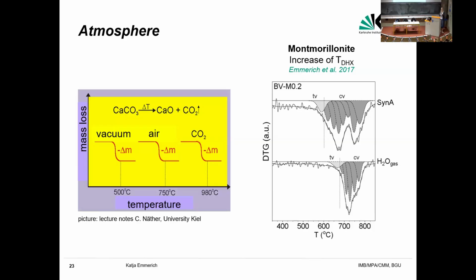Then you might apply this, or you might use these large crucibles, but then you have to think about an atmosphere that can form within the sample. Because if a gas is evolved, it has to diffuse out of the sample, and as long as it stays in the sample, you can create an atmosphere that will hinder further development of gases. But sometimes, if you think about ceramic production or any technical applications where you heat a clay or a soil, these effects also can happen.